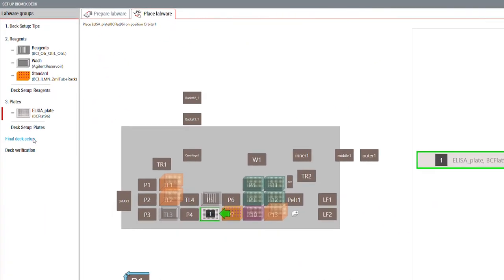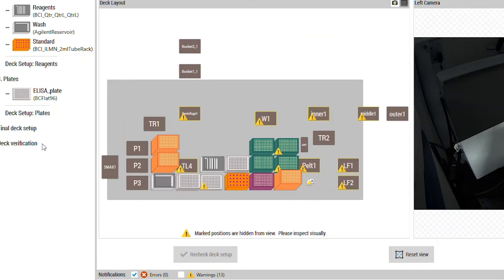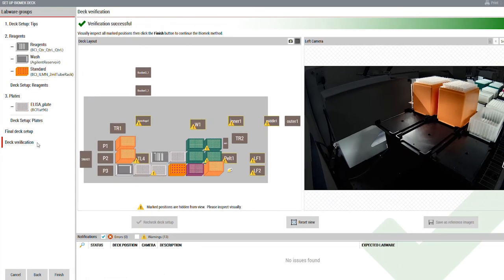Human error is part of science. Mistakes could happen due to putting wrong labware at the wrong place. DEC Optics Final Check software analyzes the deck for common setup errors and alerts you prior to the start of a run, lowering the anxiety of novice users and providing peace of mind for the pros.